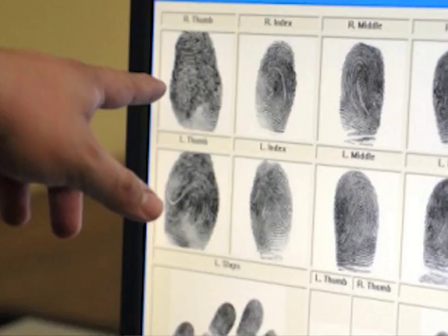Now, dear students, we will be discussing in this lecture the methodology of the iodine fuming method. Latent fingerprints may be developed by the iodine fuming technique by one of the following experimental procedures. First, here is the fuming gun method.